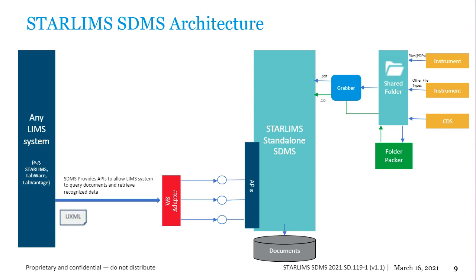For the file integration piece in the top right corner, we can see the various files from different instruments, whether they're PDFs, CSVs.